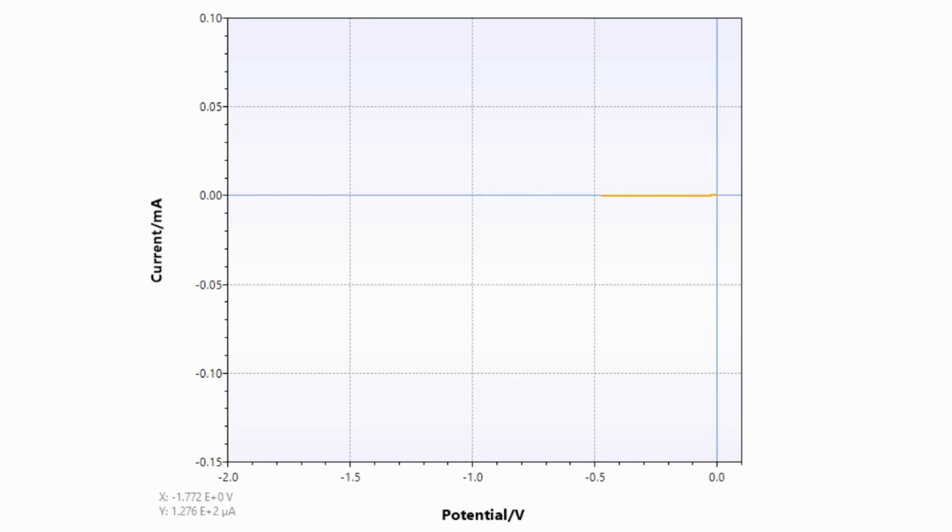And for us to see the actual difference with our responses from the previous two steps that we've done so far, we'll add the other results that we had earlier. So with oxygen, and then after degassing it. We will then see clearly the difference of the response with water.